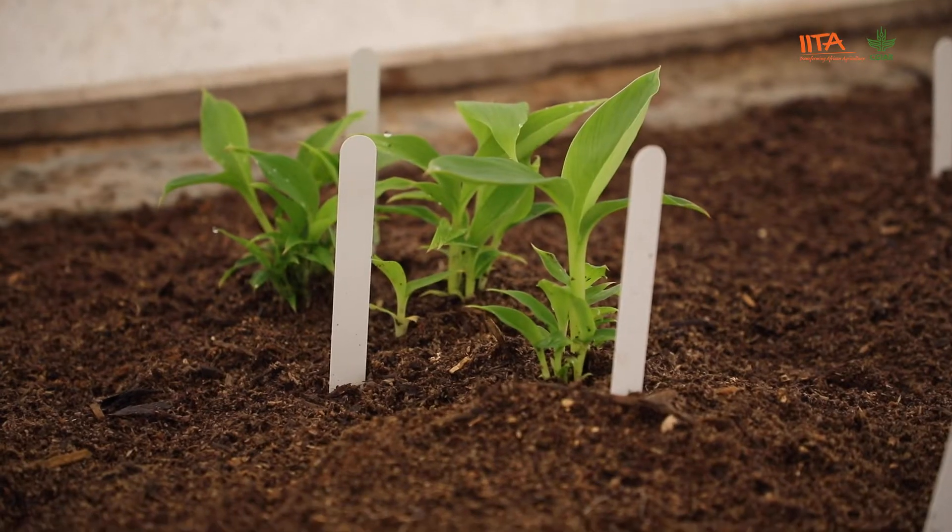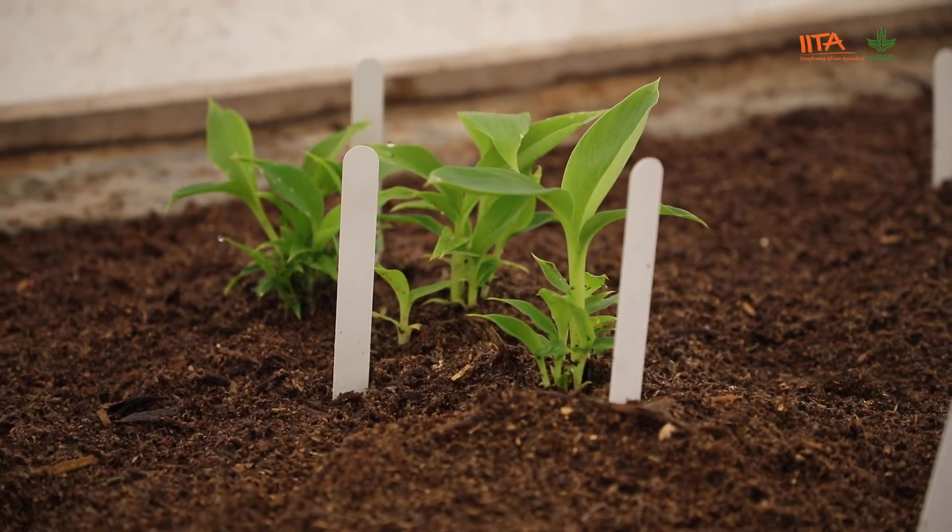We also use tissue culture to do micro-propagation to produce large numbers of planting material, and at the same time we use it for conservation of genetic resources that are used for breeding. I'll take you into our culture room to show you what we do in this lab.